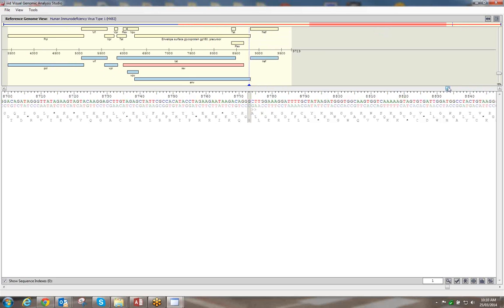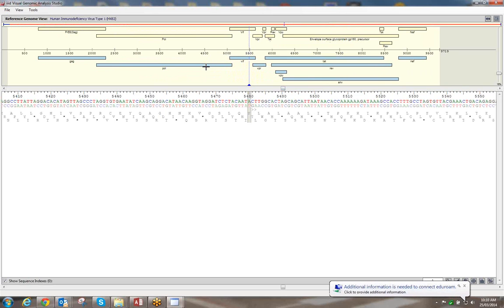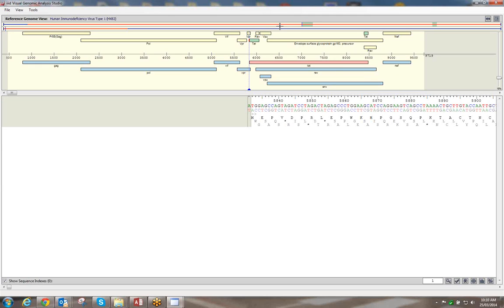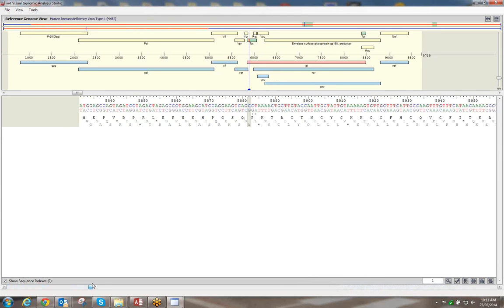The position here is the nucleotide base pair position within the genome. If you select one of the genes it turns red. The top bar represents the full genome, and the red portion is what you're currently seeing on screen. If we select TAT, this is the spliced coding sequence or protein, and it is spliced over two areas. If you double-click it becomes green and you go into the feature itself, seeing the nucleotide sequence and protein sequence for TAT.